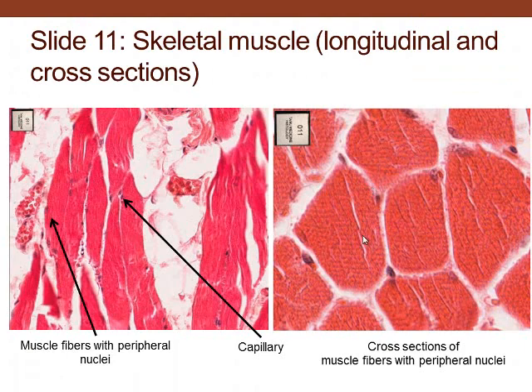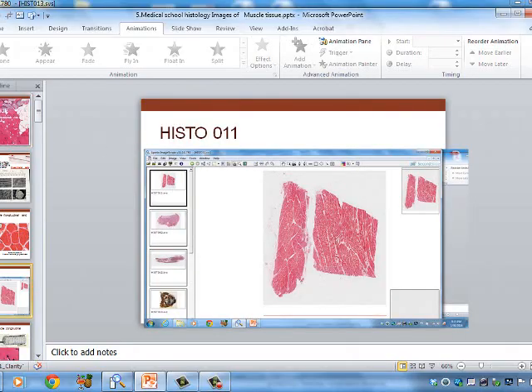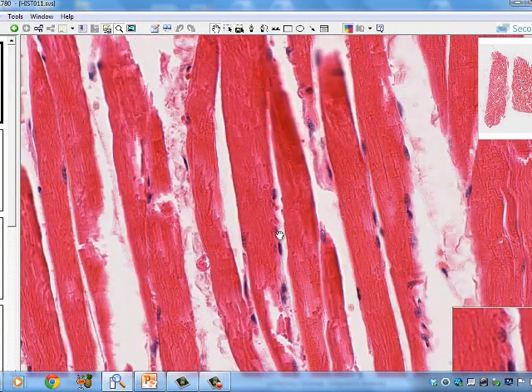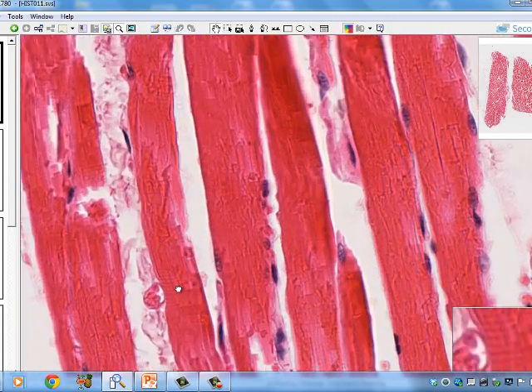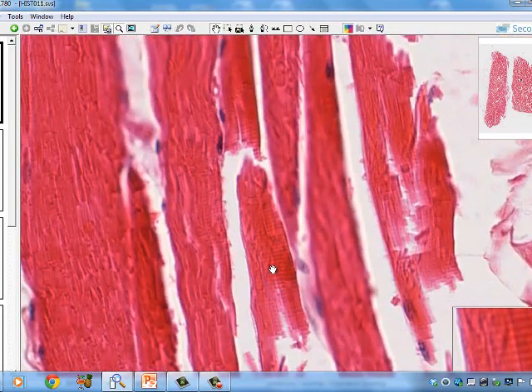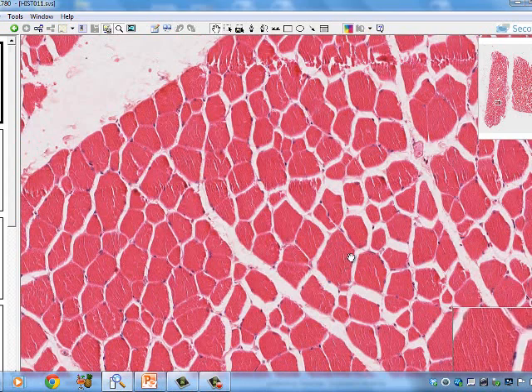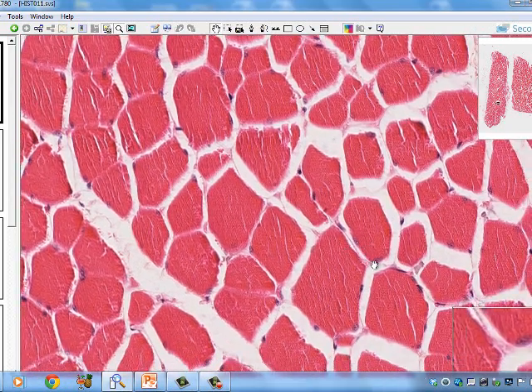Looking at skeletal muscle in slide 11, the nuclei are located on the periphery and there's more than one nucleus in individual cells. In a longitudinal view, these are the nuclei of the muscle fibers. A muscle fiber and a muscle cell are the same thing. We can see striations — the A and I bands — and the nuclei are on the periphery. In cross section you can't see the striations, but the nuclei are located on the periphery.